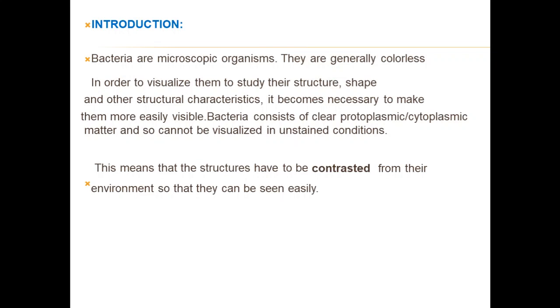So can we observe these microorganisms in unstained conditions? No, we cannot visualize them in unstained conditions because these microorganisms consist of a clear protoplasmic or cytoplasmic matter.